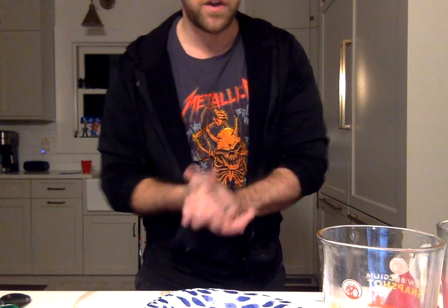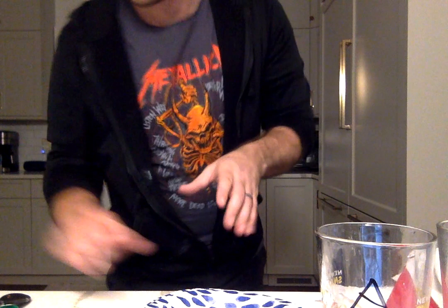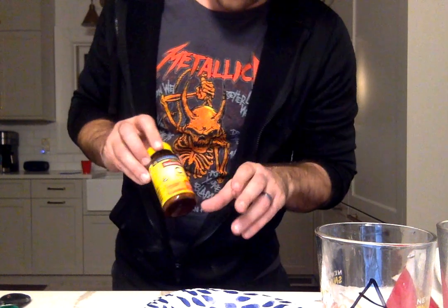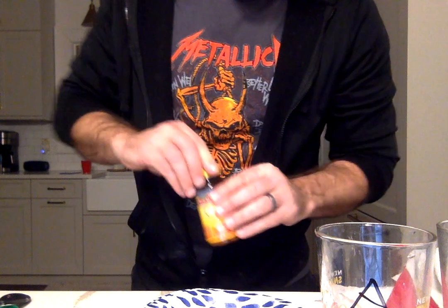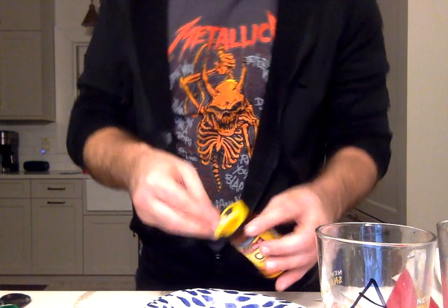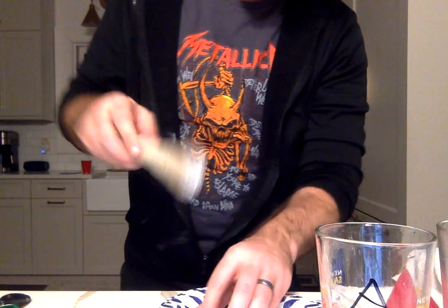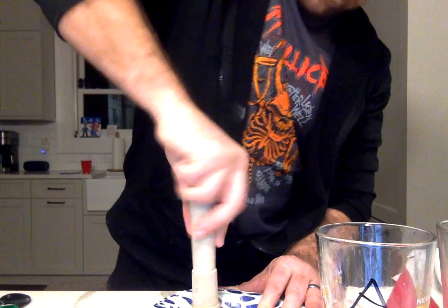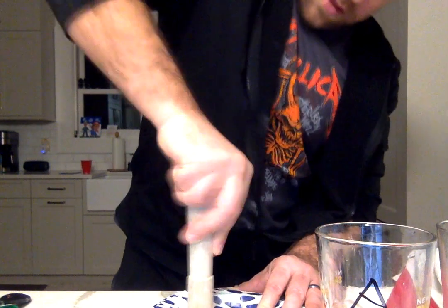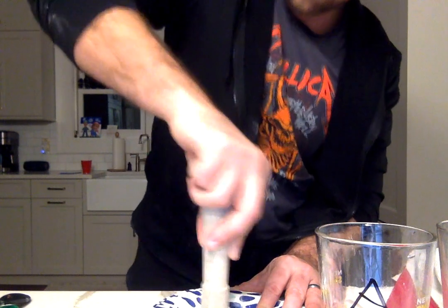So two solutions: a solution A and a solution B. As far as materials are concerned, I have some vitamin C. I'm going to use 2,000 milligrams of vitamin C. I have a 500 milligram container, so I'm going to pull out 4 tablets. I've got a muddler to crush that up, so I'm going to start on that. Get it into the smallest pieces I can, really get it so it can dissolve.